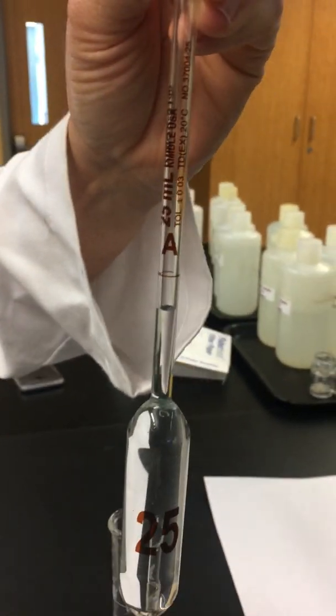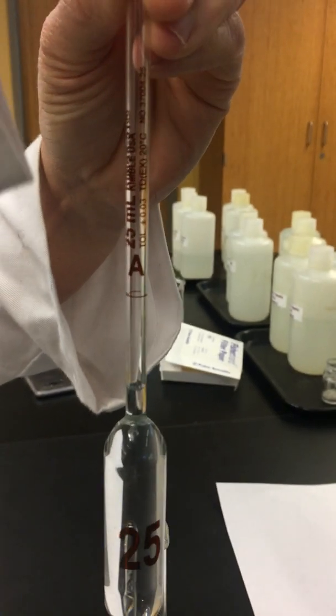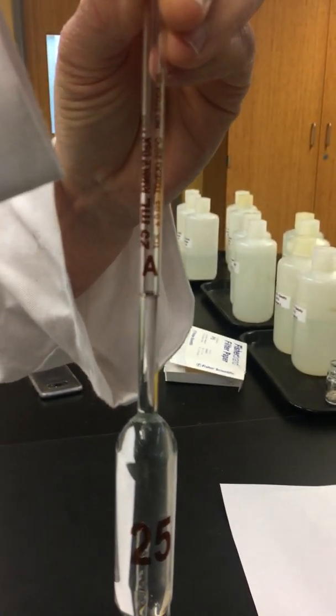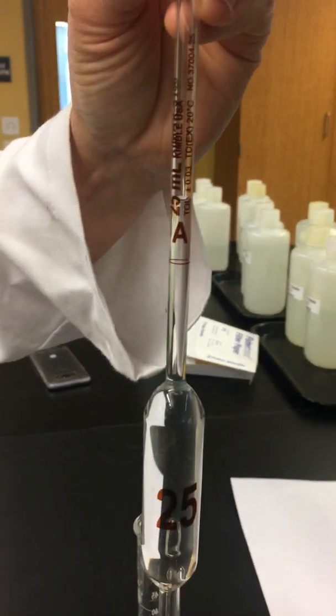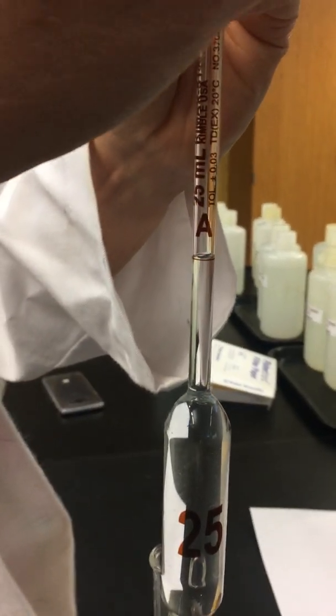So if it happens where you go a little bit below, you just put the pipette aid back on, pull it back up, and try it again. Look at that. So we got it perfect.